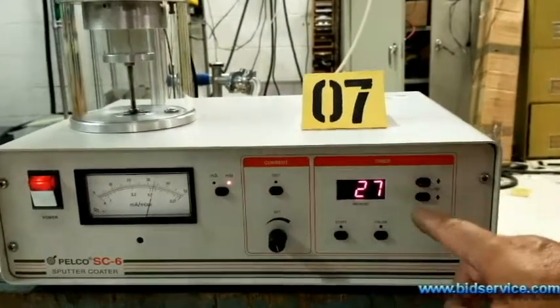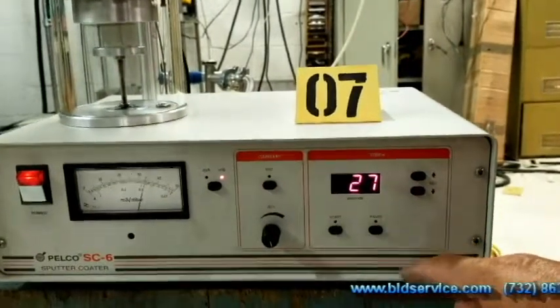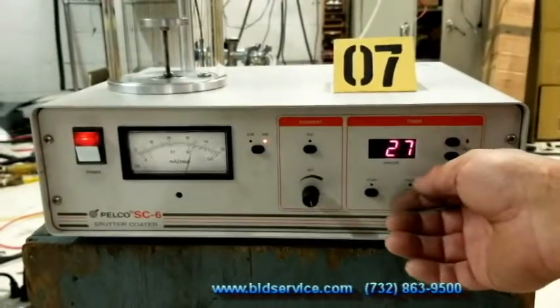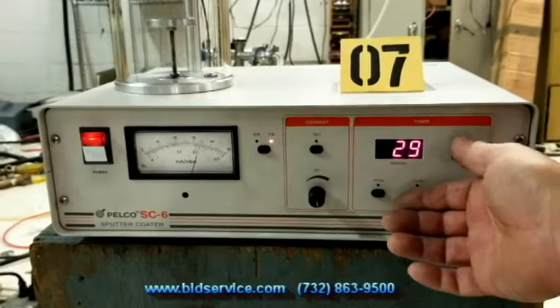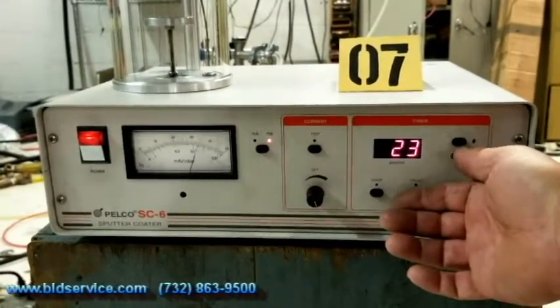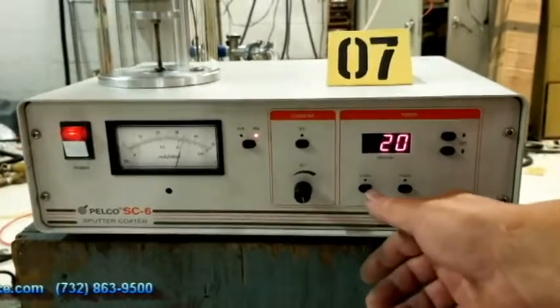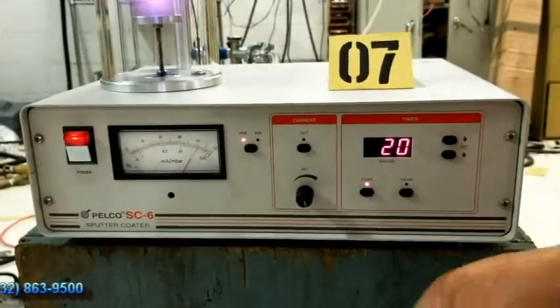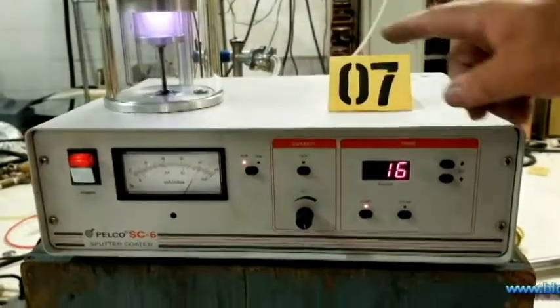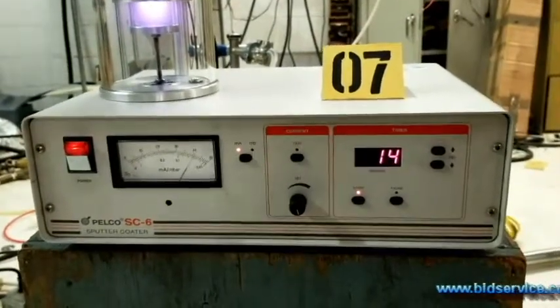Over here is your countdown timer. In order to make this operate correctly, you hit push pause, set the time you want — I'm going to have this set down for 20 seconds — and then you would just hit start. You can see you get your plasma coming on and it's counting down.